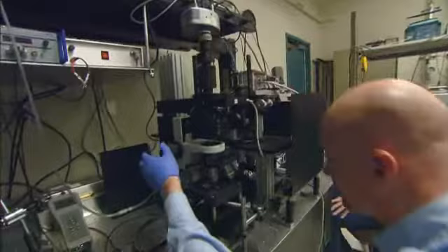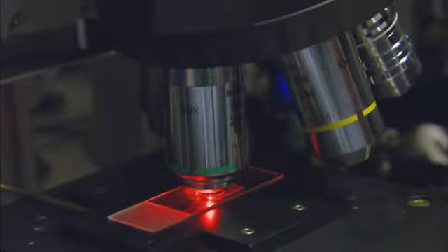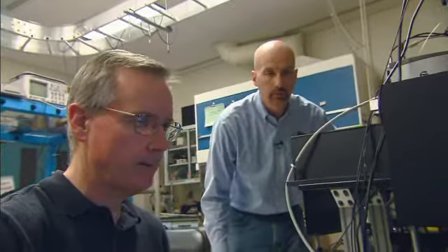They began with laser scanning confocal microscopy, a fairly common method of obtaining high resolution 3D images through the optical sectioning of samples.